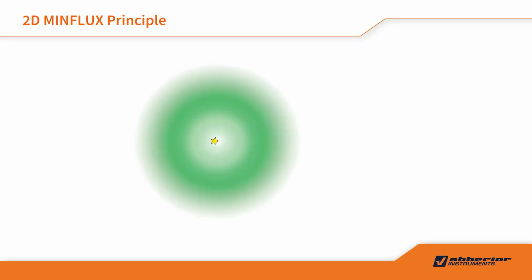So during the single molecule on state, the molecule is blinking, right? What does that mean? It means in a certain time, in a certain area, only one molecule is on, is blinking. You can see the signal, okay? At that moment, we try to hit that molecule with the center of the excitation donut.